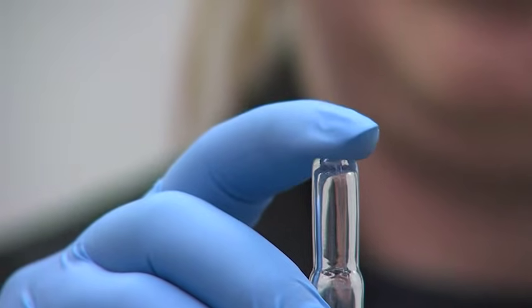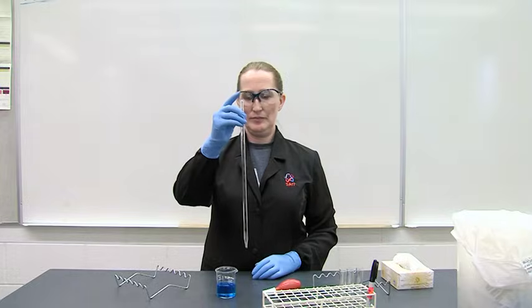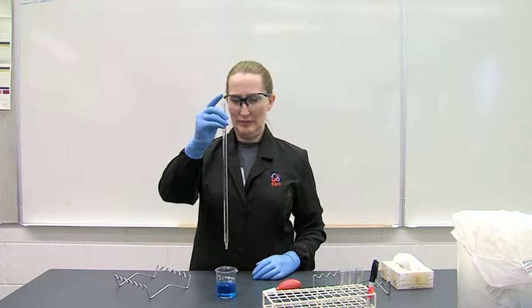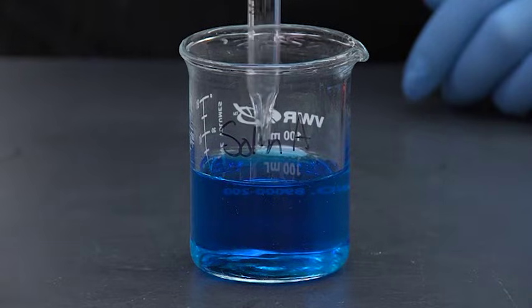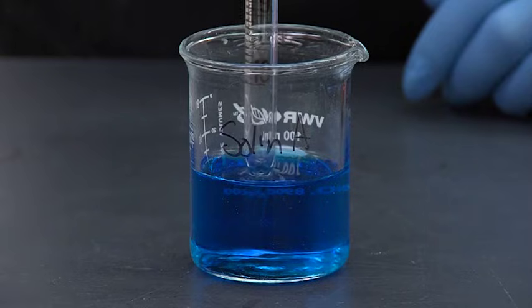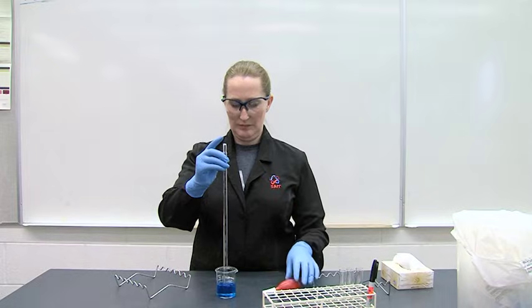Hold the pipette vertically through the rest of the steps. Place the tip of the pipette into the fluid to be measured. Make sure that the tip is far enough into the fluid to fill the pipette without drawing up air.